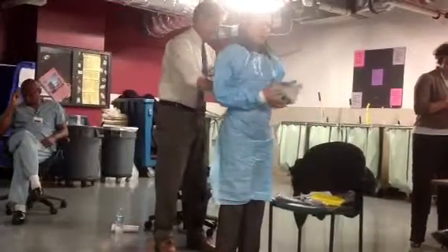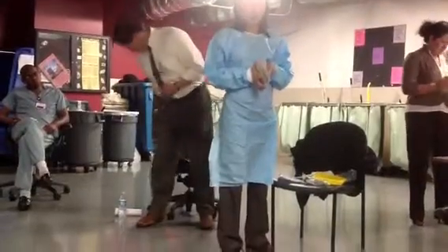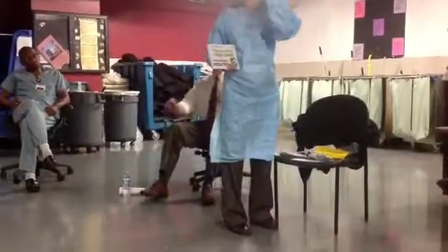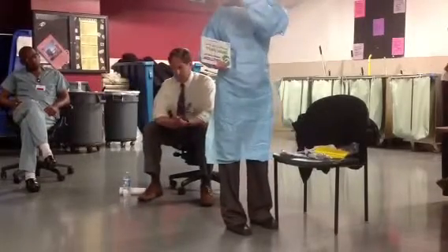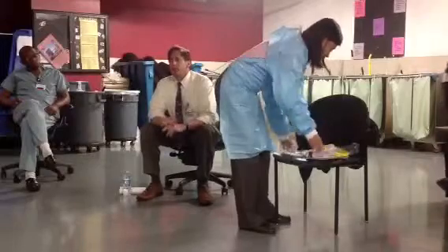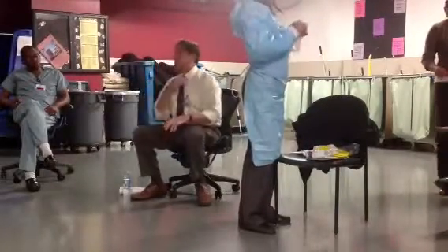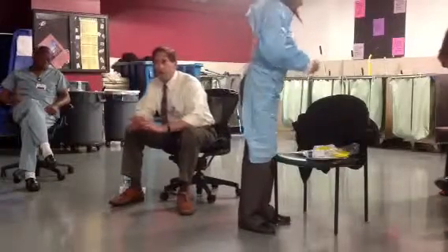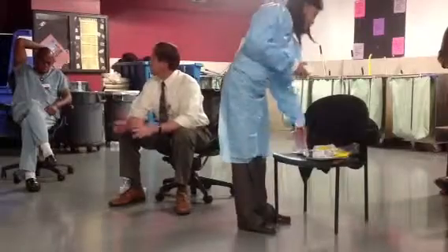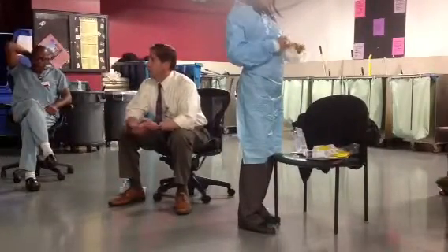One thing I also want to say, during a spill, if this is off hours, do ask the nurse of the medication what kind of drug is being spilled. Just write it down so that we can keep track of what it is. That's something we do when we clean up spills with varying degrees of success, but we're pushing more and more that a nurse, a pharmacist, someone in the area stay there while we clean up the spill, because they're the ones who are knowledgeable and can also help out.